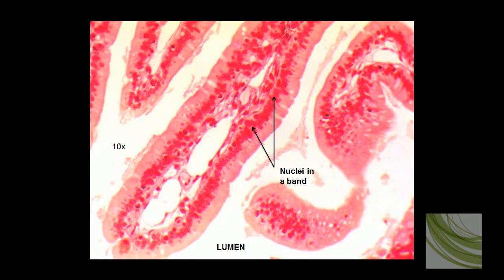Here I've increased magnification to the 10X objective, and we can see the simple columnar cells. We can see these nuclei in a band. This is a villi, this large projecting structure. Here is the lumen, or the space.